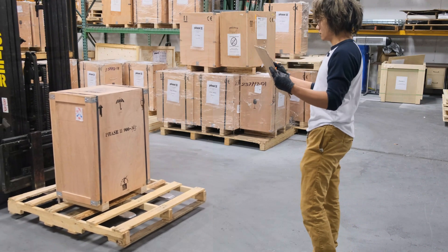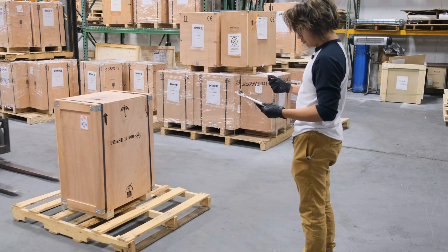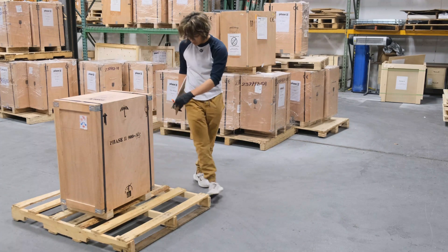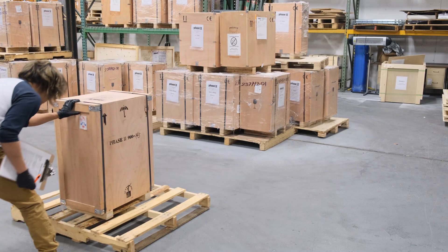After your unit has arrived, expect to see it strapped down to a pallet. Ensure that careful inspection is done to both the packaging as well as any indicators affixed to the machine, such as the tip and tilt indicators. Notate any abnormal signs of damage on the shipper's receiving forms.